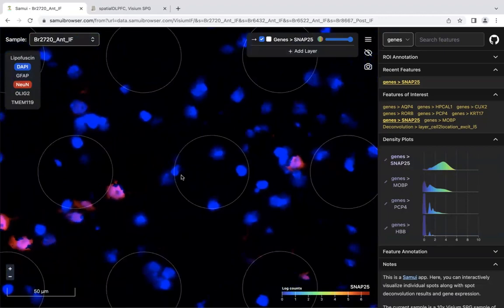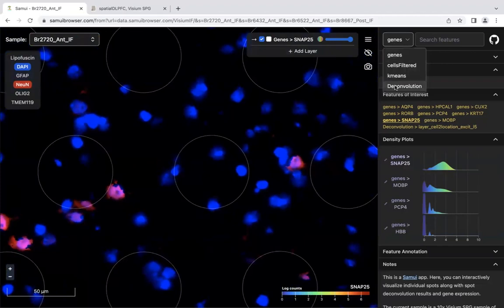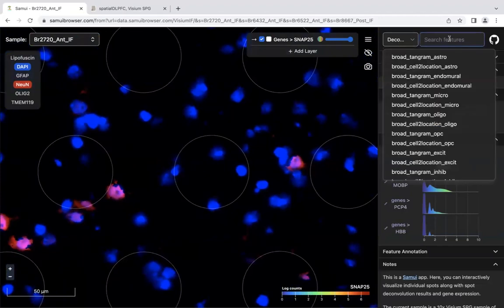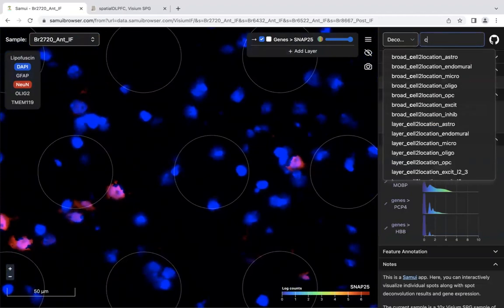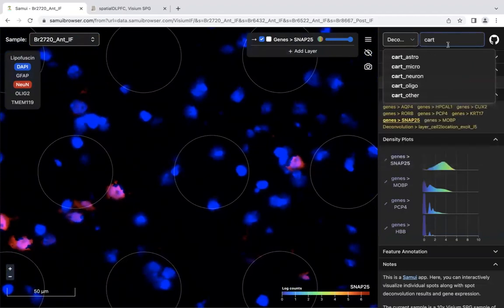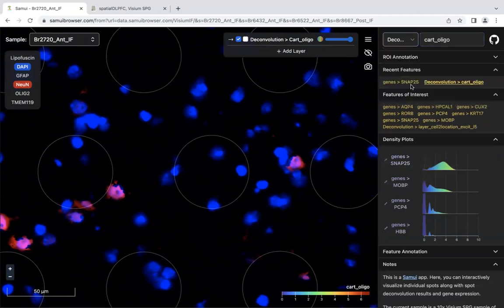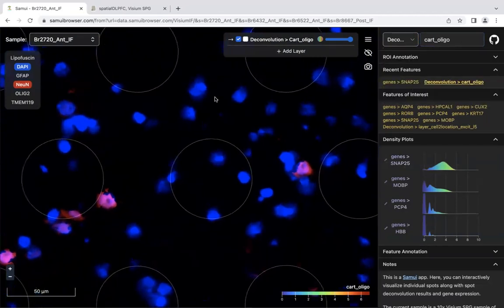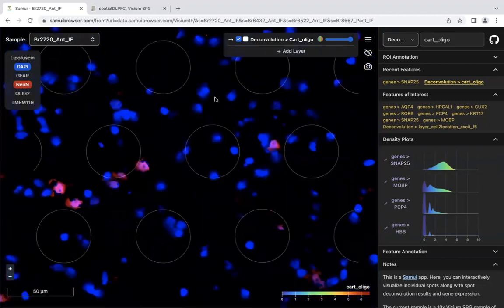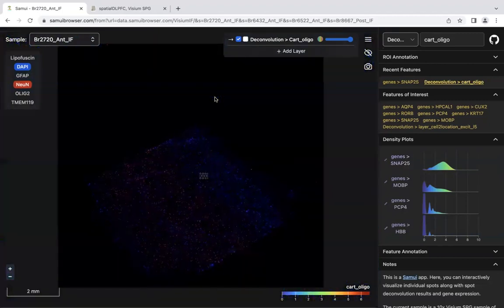But in terms of viewing the spot deconvolution results, let's check over here. Deconvolution. Let's say we want to look at the decision tree results for all the oligodendrocytes. I'm going to click over here.